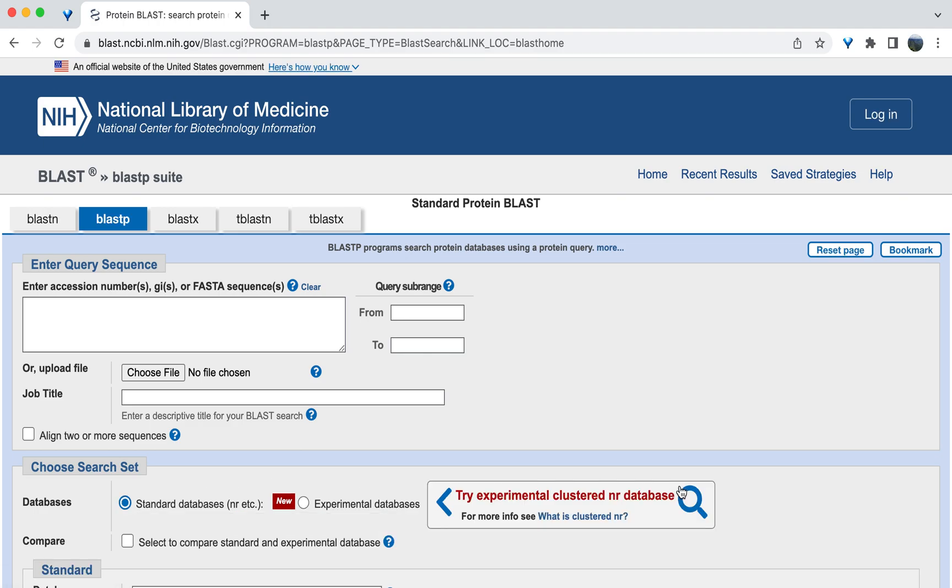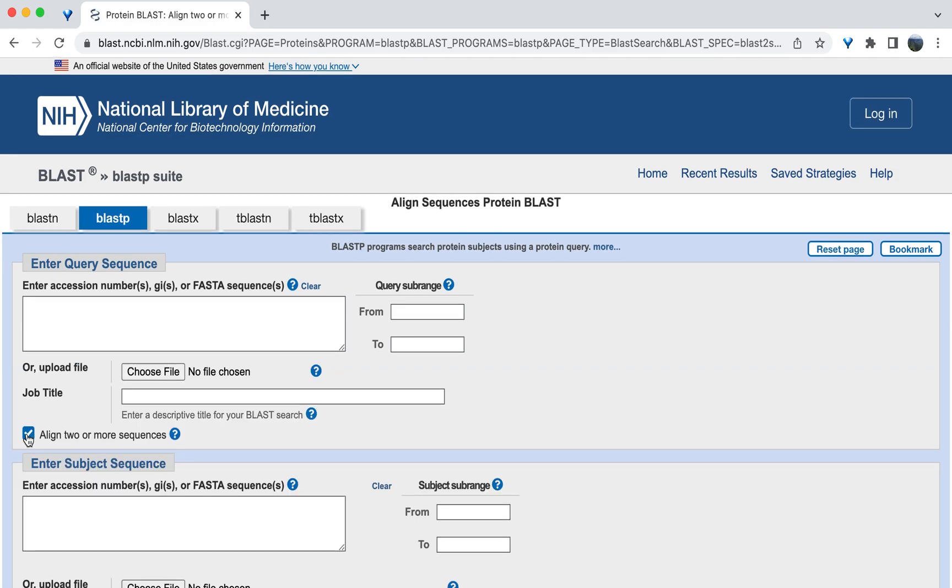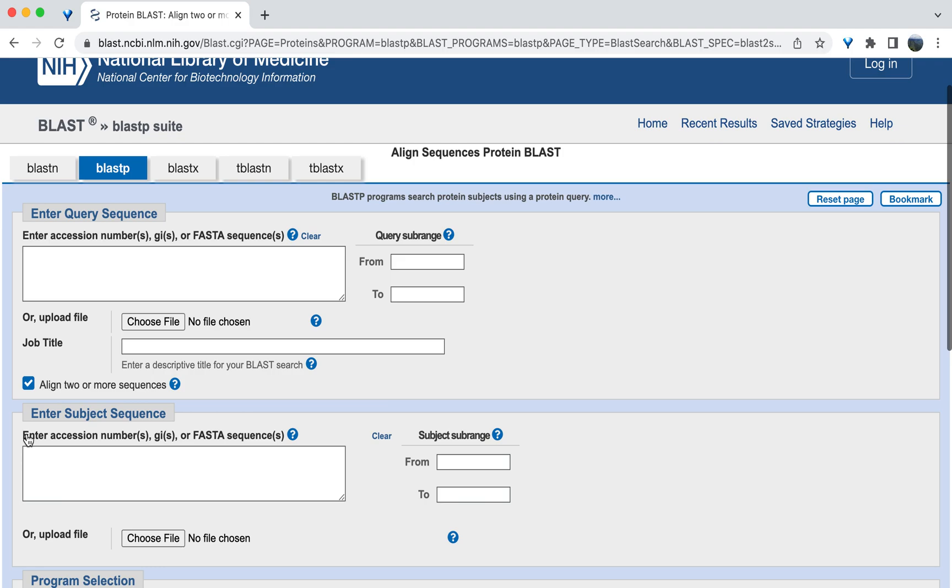Once Protein BLAST loads, check the box align two or more sequences to load a second entry box. Without checking this box, you will not be able to compare two sequences.